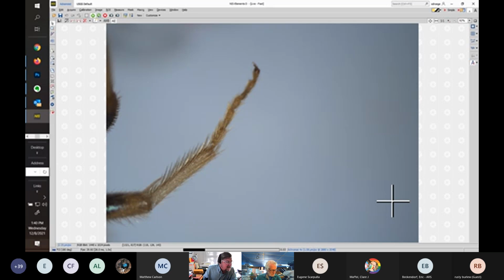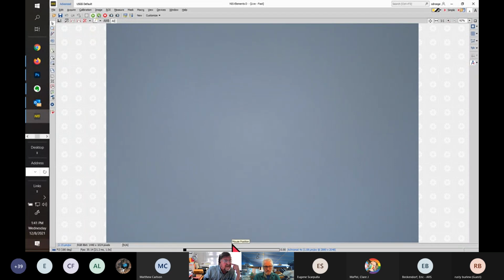So when you look at these hairs, even though they're not exactly the same, they're pretty much the same length. And persimilis will be a little different. Color of the leg, don't worry about color. In general, those segments, the basitarsi, are yellow, but that's not very important. Okay, I'll put a persimilis up. How about that? Okay. I've got to make sure I put these in the right box. And here is persimilis. It should be a pretty good shot.